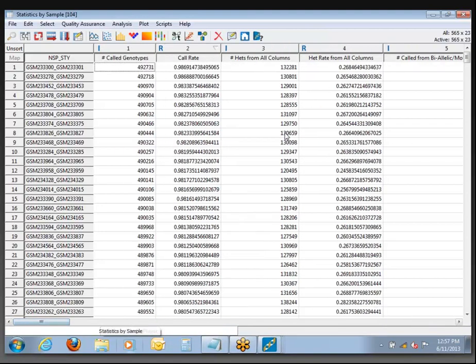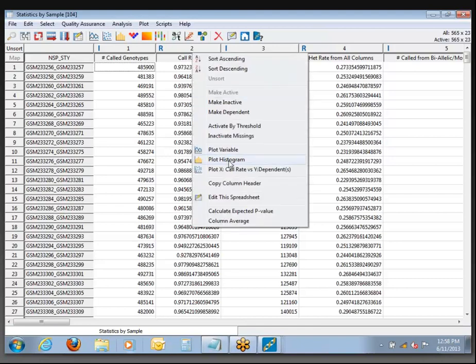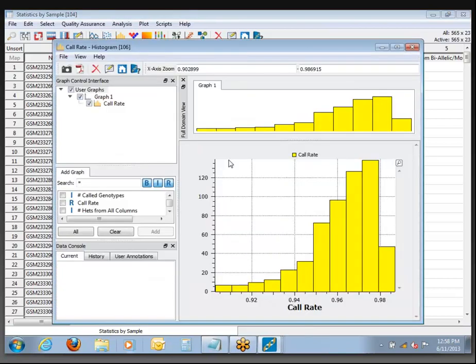Let's come back to the second column and click the Unsort button — that's up here at the top left — just to show you it's there; it reverts to the original sort order. If you right-click on this column again, you see this option about two-thirds of the way down to Plot Histogram. This is the SVS Plot Viewer that should pop up on your screen, where you should see the distribution of call rates. We can tell that the minimum is right around 90 percent.